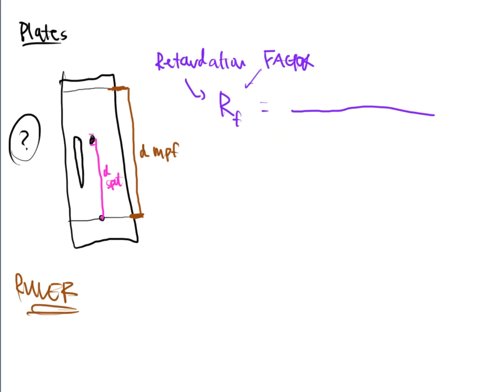Now we have a problem, because do I measure the bottom, or do I measure the top, or do I kind of do somewhere in the middle? Well, that's up for you to decide. And quite honestly, if it was me, I would not be happy with the smear, and I would completely redevelop the TLC plate, and I would maybe put less compound on it this time, and hopefully I will end up with a cleaner spot or a circle that I could measure. That would not be acceptable to me. I would want to redo it, just because personally, deep down, I know it's wrong.